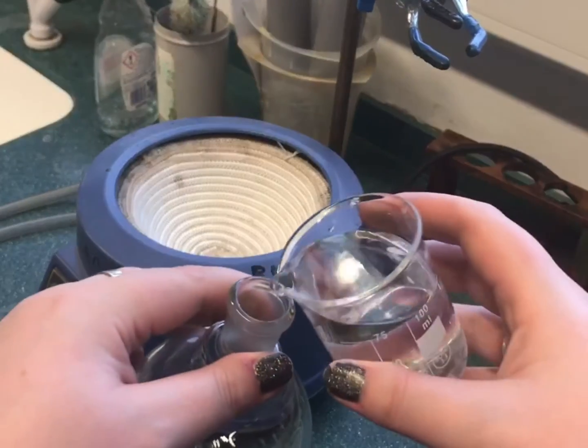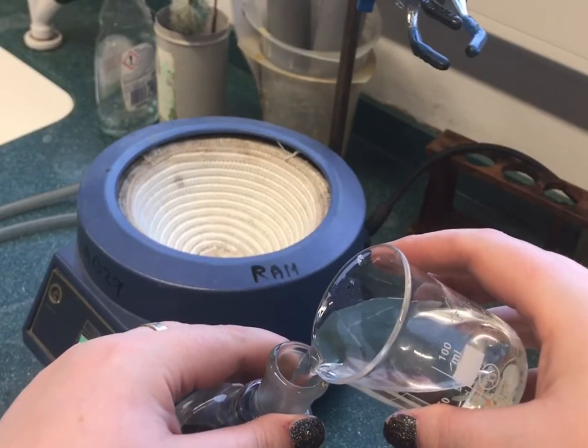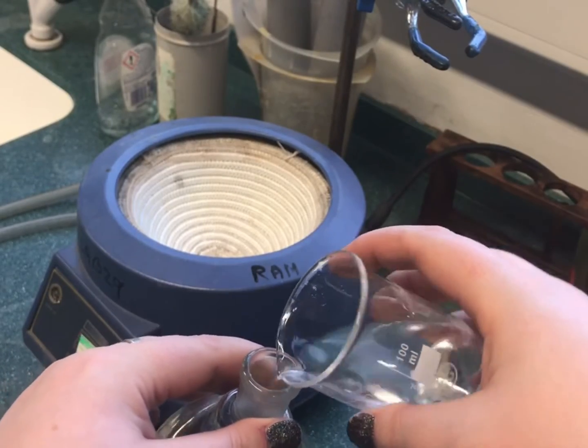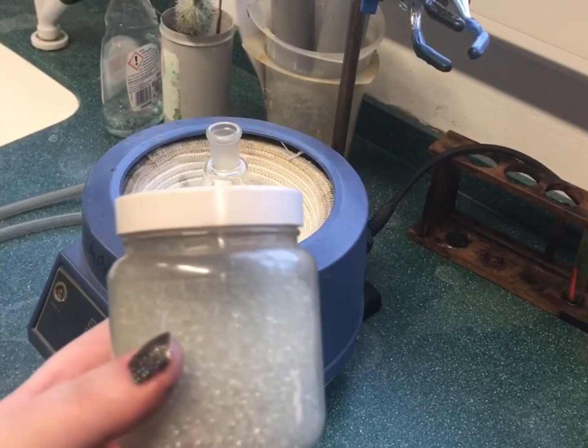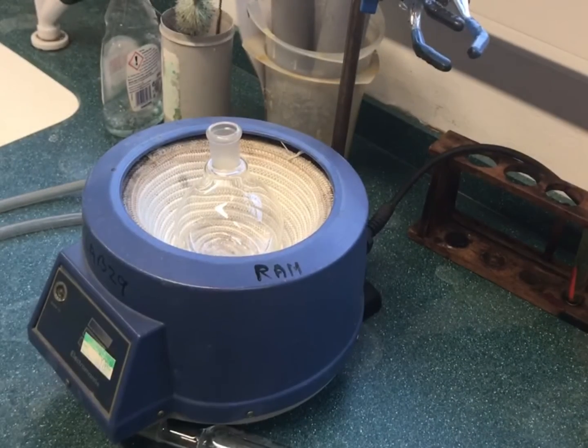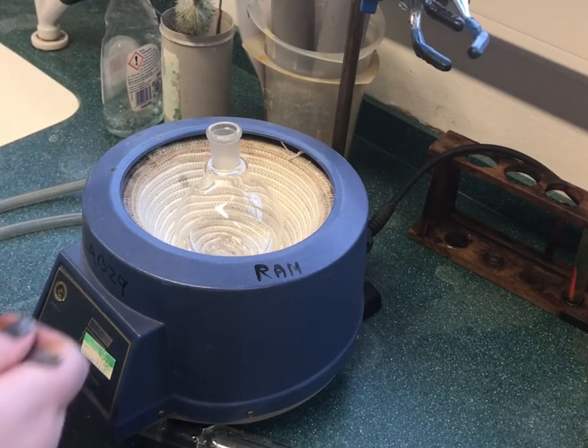An electric heating mantle or hot plate are used to heat the reaction mixture in a round bottom flask. Antibumping granules are used to ensure smooth boiling. An appropriate sized round bottom flask must be chosen for the reaction, as this should be no more than half full.